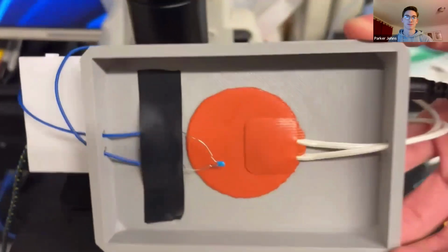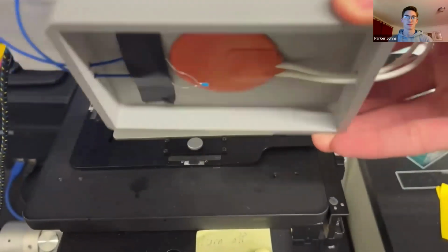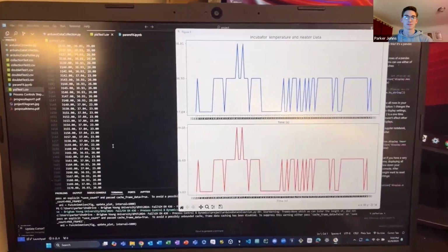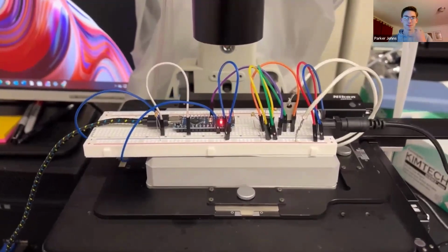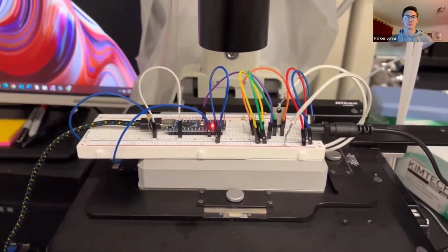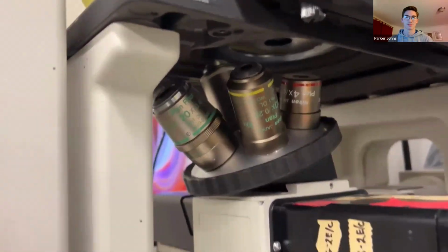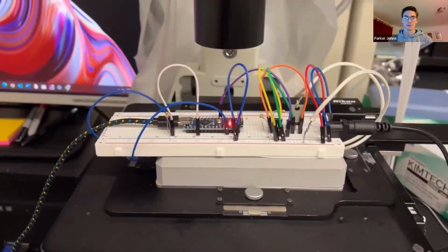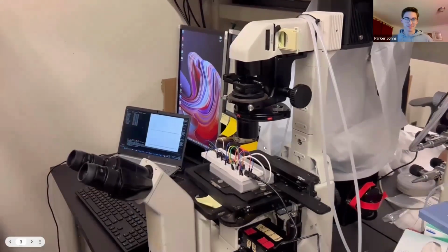In order to solve this problem, we 3D printed a microscope cover, attached a heating pad and a thermistor, and created a temperature controller that maintains the 37-degree set point. The apparatus is able to stay in place even with movement of the microscope tray. The cover does not need to be removed at any time during the experiment, and the microscope slide can be seen through the bottom of the tray or on a digital monitor on the side. This solution allows for more accurate temperature control and overall simplifies the actions in the research lab.